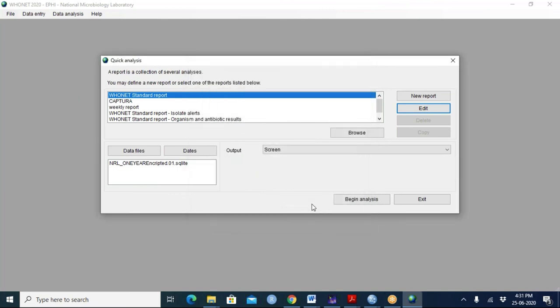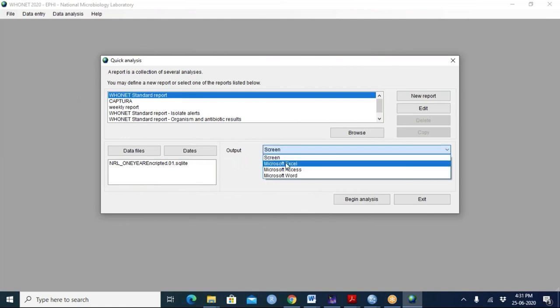Click on outputs to screen. My goal here is to add, and the Word file works, but what we want to do is make a very pretty, attractive report that you can share with the physicians, with the IDDS people, other colleagues. So you as the national data managers, you want all the details. But if you want to share this with somebody else, they don't want the same level of detail. They want pretty things and text, a nice cover page. So we're sort of moving in that direction.